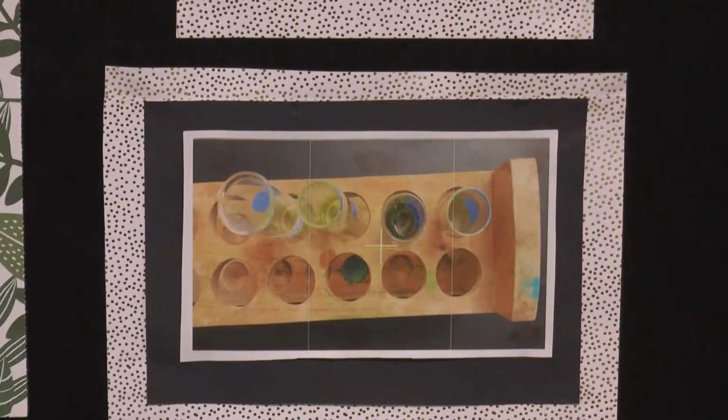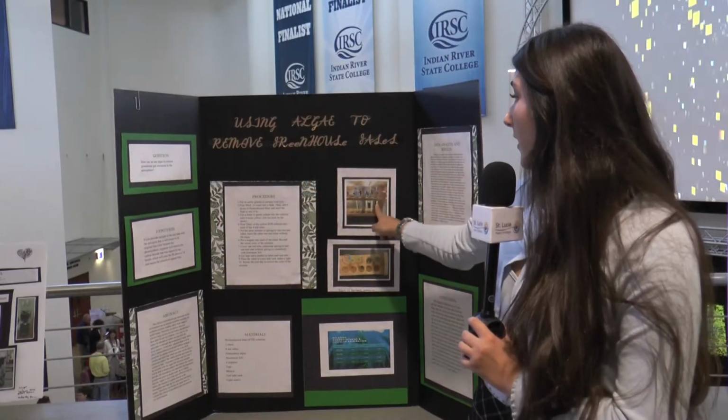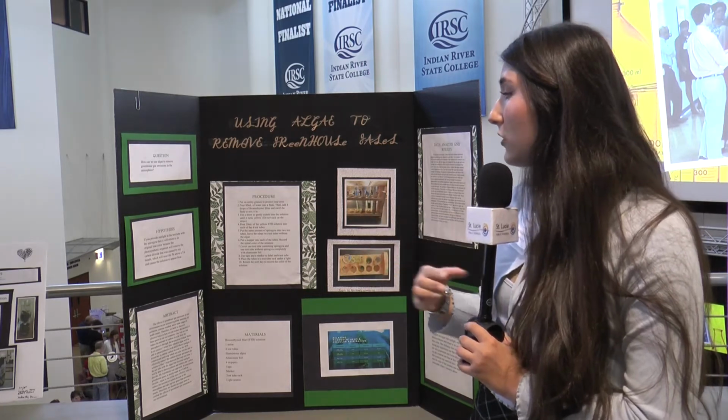And then I got green filamentous algae, and I cut it into 2 equal pieces. I then put the 2 pieces in 2 of the test tubes. I then put a stopper on all of them and marked them 1 through 4. After they were marked, I put aluminum foil on one of the test tubes that had algae and one of the test tubes that did not have algae. As you can see here, this is the test tube that had the algae, and this is the test tube that did not have the algae.